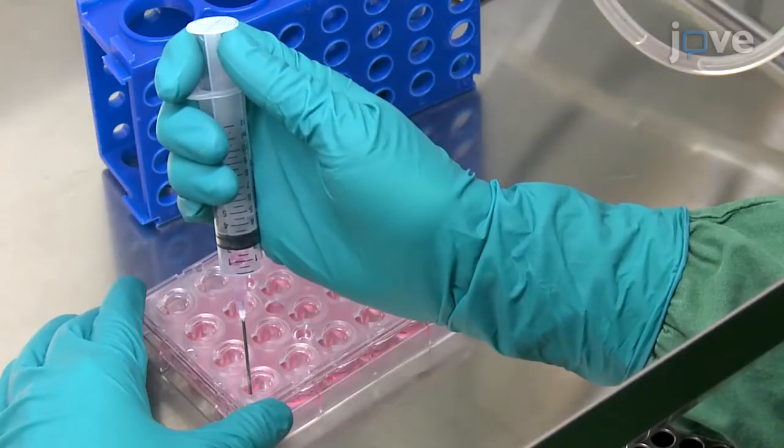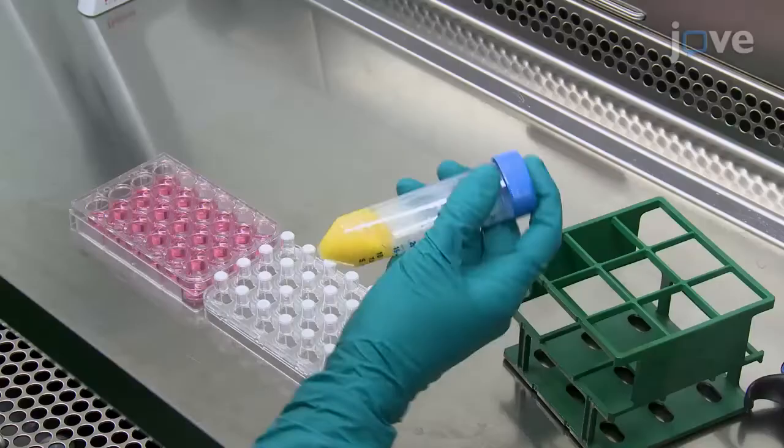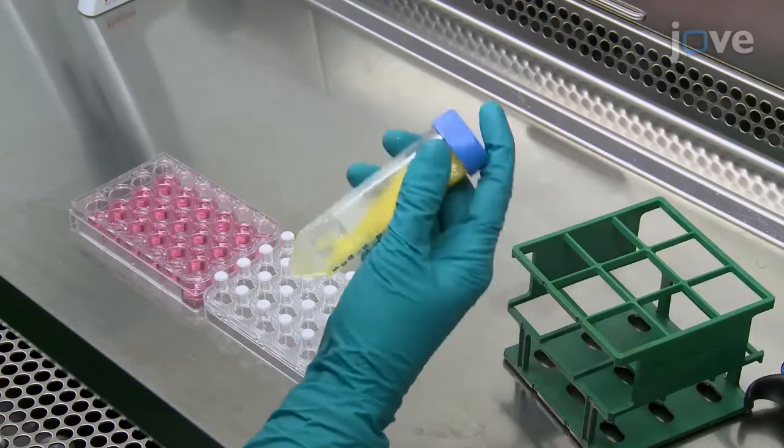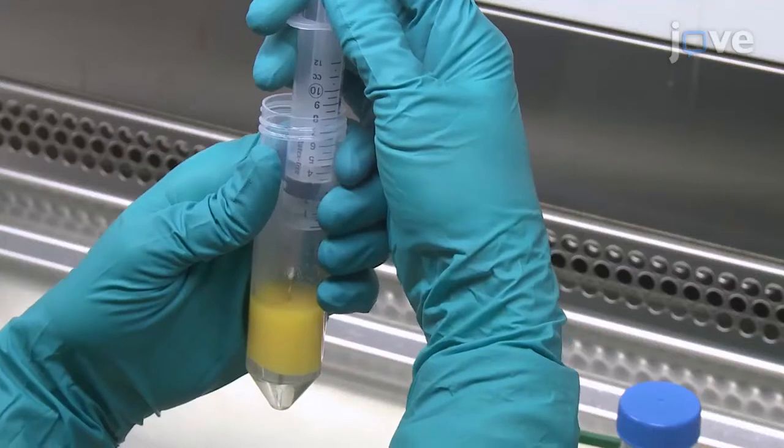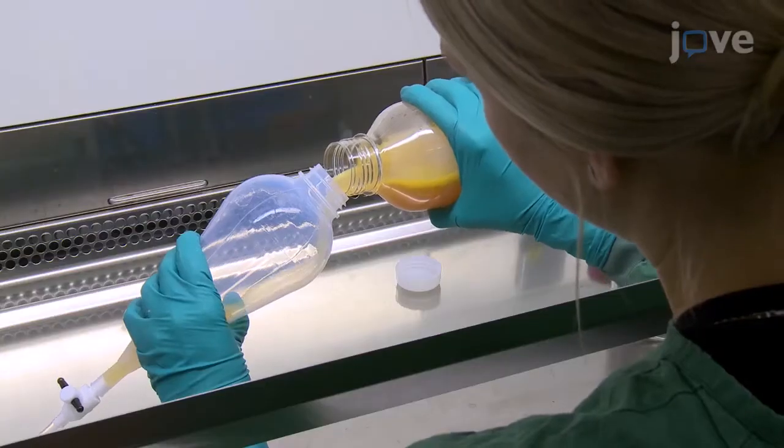One challenge in the field of adipose biology has been to maintain mature adipocytes in culture. We have developed a new method that allows the study of long-term adipocyte phenotypic changes. Our adipocyte co-culture technique allows the study of cell interactions and will hopefully be useful for the development of new treatments for diabetes and obesity. It is important to follow the protocol carefully, as there are some critical steps that greatly impact the yield, quality, and the viability of the mature adipocytes.